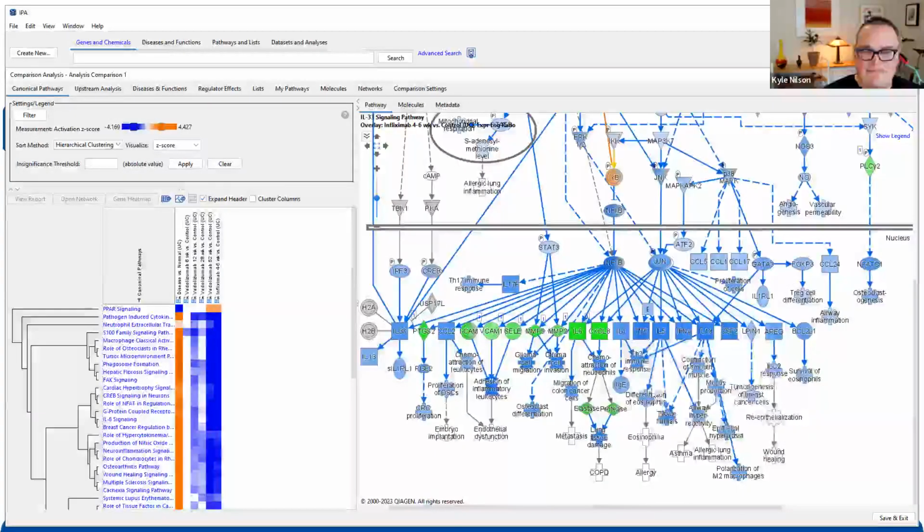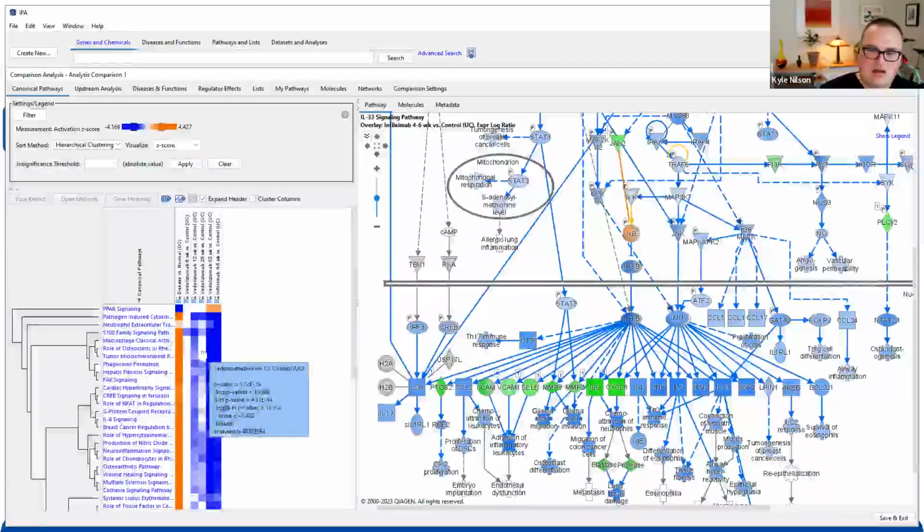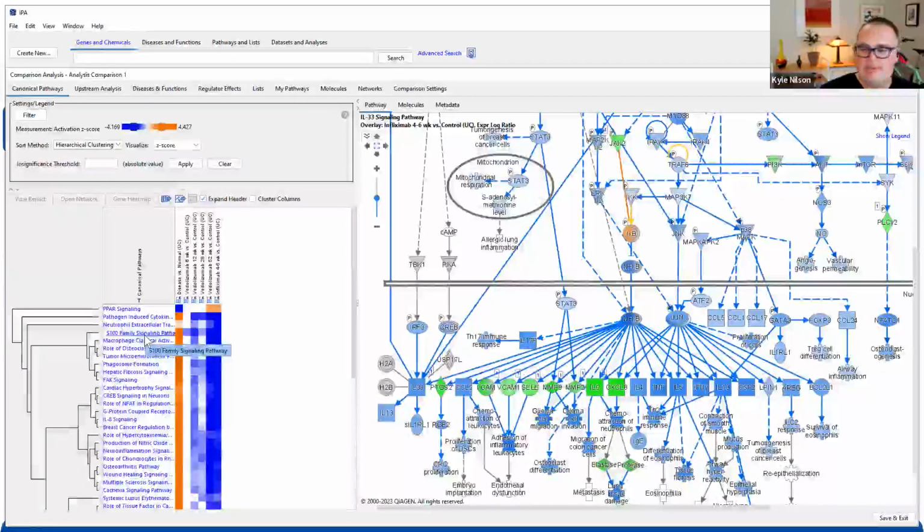Awesome. Thank you, Tim. So as I showed before, if I happen to have opened this pathway and saw a gene that I was potentially interested in, I can click the blue link to load the corresponding entry.